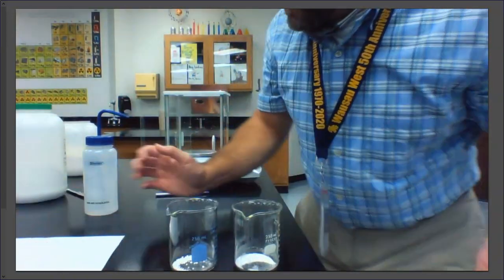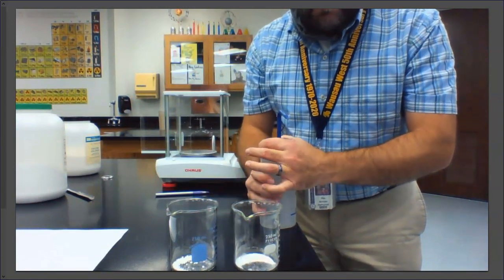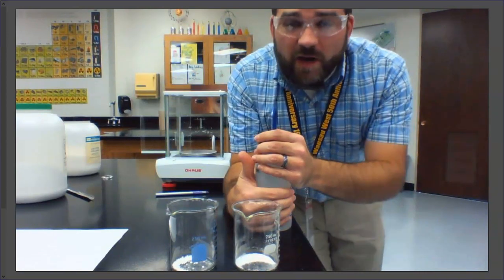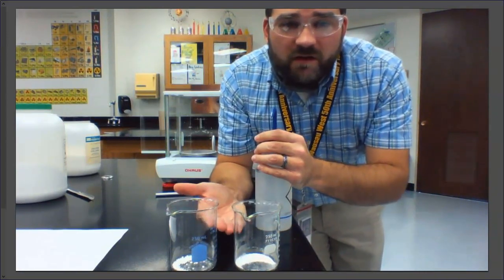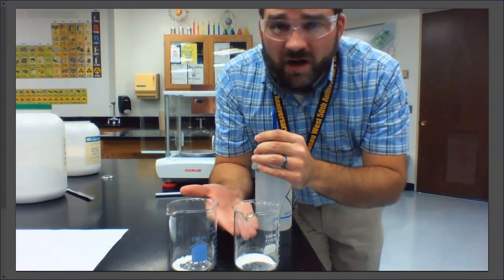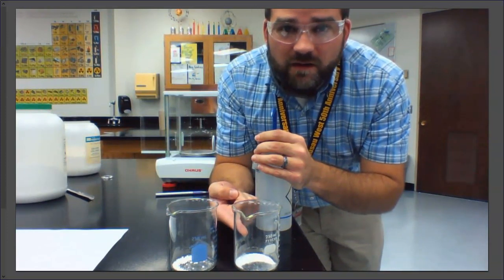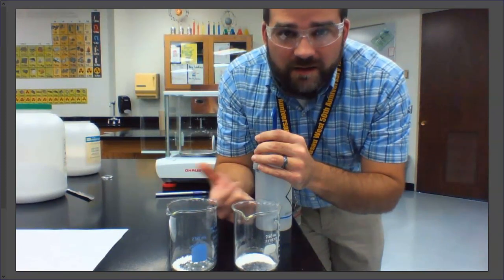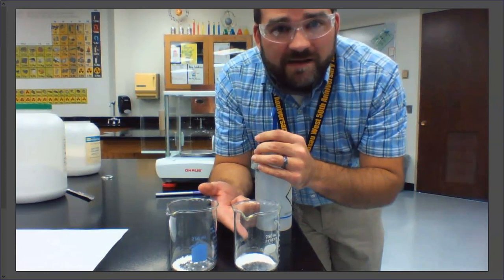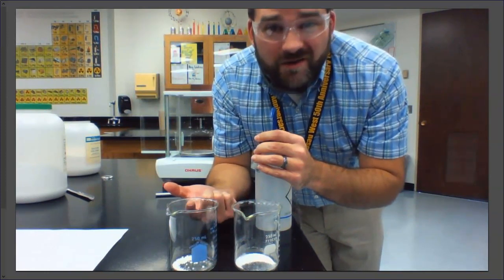All right, now, the next step of my procedure says I should totally dissolve these compounds in water. And I say about 20 milliliters. Here's the deal, and this question would have come up if you were here, I promise. We want to dissolve them in water. But if I use 10 milliliters, or if I use 100 milliliters, does it change the amount of chemical of the sodium carbonate or the calcium chloride? And the answer is no, it doesn't, right? The moles of sodium carbonate is based off of the mass I just added. So I can dissolve this in any amount of water that I really want to.